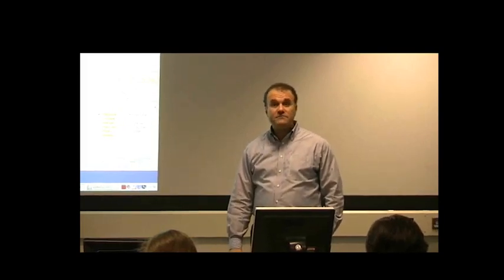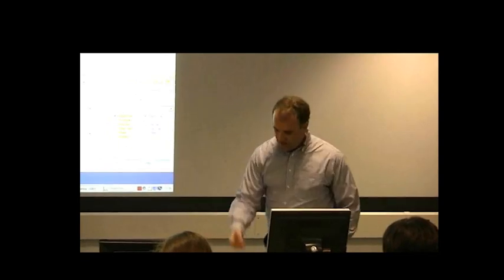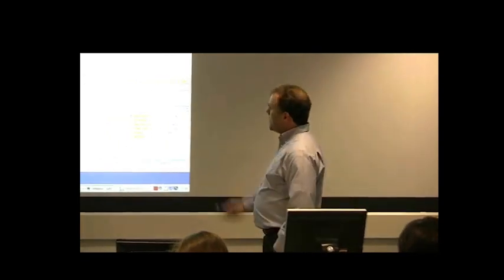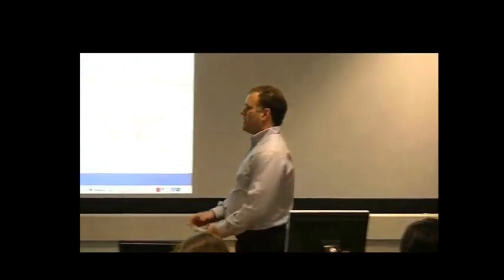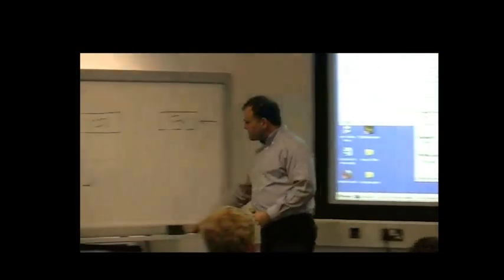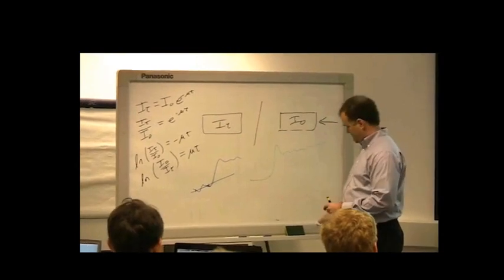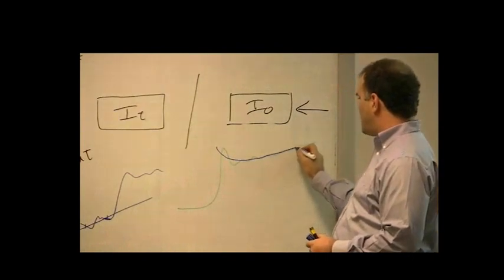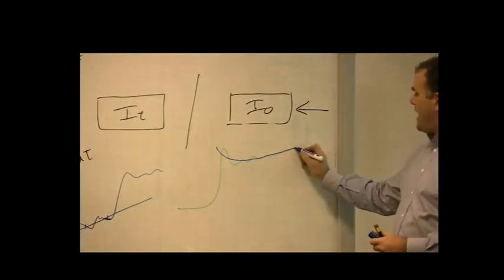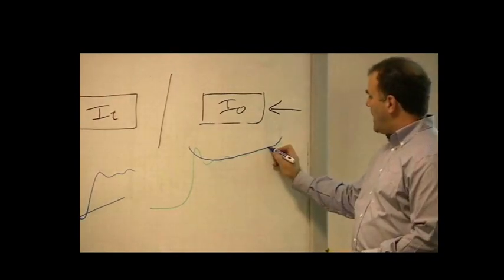Yes? The spline clamps. Spline clamps, right. So the question then is about this part of the screen. So you will find sometimes that you will have data that do this. And you'll find that the background function will do a good job for most of the way, and then sometimes will show a tendency to wing up or wing down, something like that.